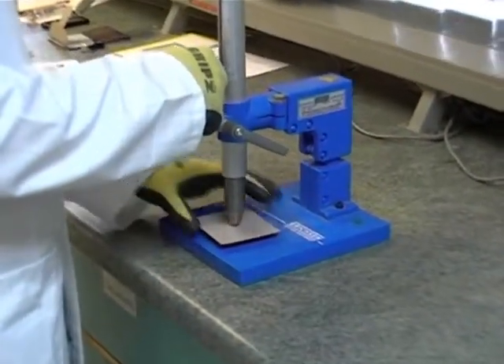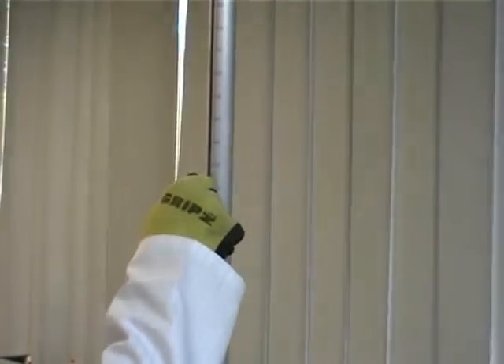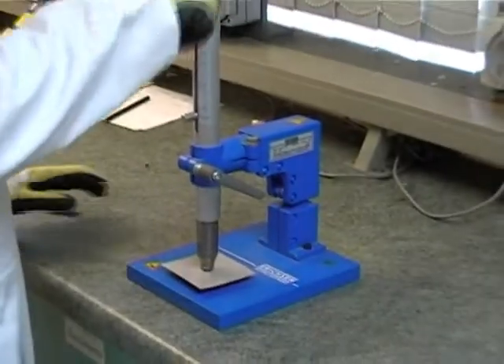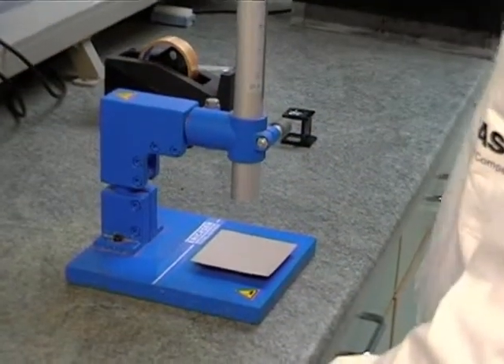The weight is lifted to the required height, then dropped under gravity to produce a rapid indentation. This is a highly reproducible process.